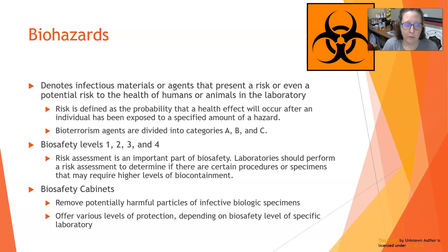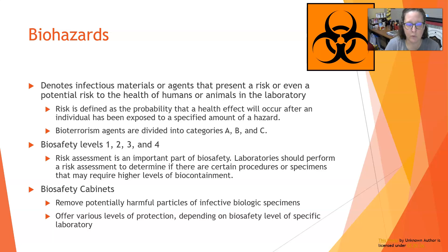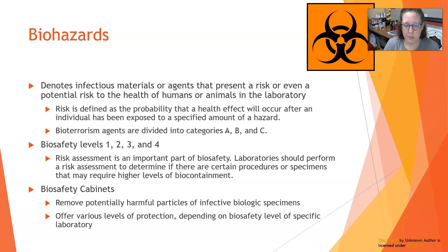That health effect could even be death. Bioterrorism agents can be divided into categories A, B, and C, but more specifically we're going to talk about biosafety levels — levels of containment: levels one, two, three, and four. Labs need to do a risk assessment to determine what level of biosafety they are and whether they need specific procedures or equipment to facilitate more biocontainment.